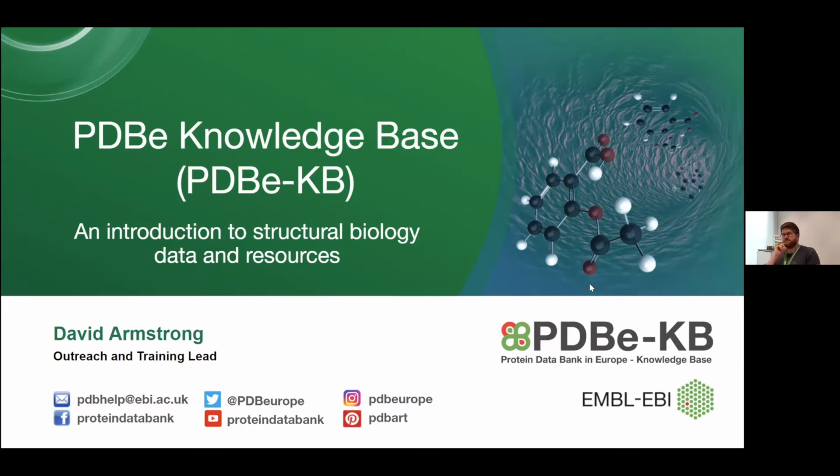Hi everyone, I'm Preeti. I'm one of the bioinformaticians from the team, and I work on various data pipelines which expose data on PDBe and PDBe-KB pages. And today I'll be talking to you about aggregated views of proteins and a part of our biochem graph project later. Yeah, thank you. So what I'm going to be talking about first is introducing you to the PDBe KnowledgeBase, which is a new resource that we've created, and specifically then going on to talk about the protein pages that we have for aggregating that data together.